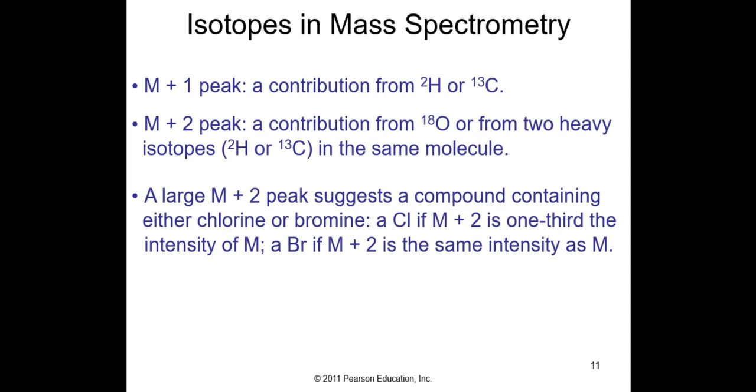Now with bromine, look at the periodic table. With bromine, you're at 79.9 is what they show for atomic bromine on the periodic table. That's because you have contributions from 79 and 81, and they're about 50-50 naturally occurring. So their periodic table comes in at 79.9, because the atomic mass shown in the chart is a contribution from the isotopes that are contributing. Carbon, for example, 12.011, because you have a little bit of C13, a little bit of 14 that boosts it up to 12.011. Fluorine, there is one isotope, F19. Fluorine does not have any other partners. It's 18.98, or what we call 19.